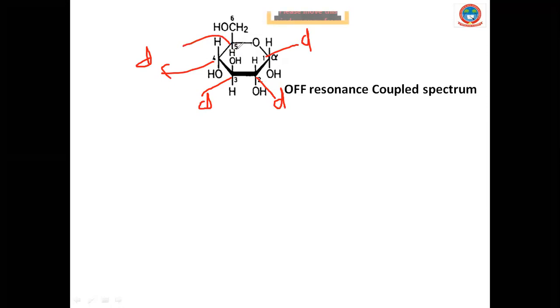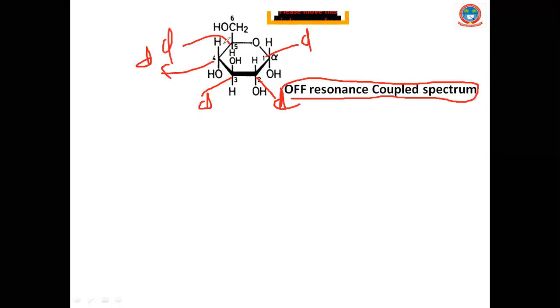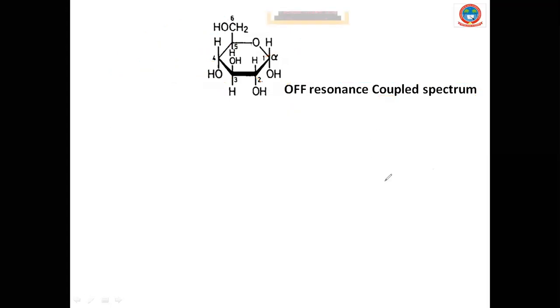One H. What is the off resonance? Focus. Understand. Doublet. What about this sixth carbon? The triplet. Very good. Triplet. Very nice. So clear cut. Off resonance must be remembered by you always. You must remember off resonance. What is off resonance? Fine.